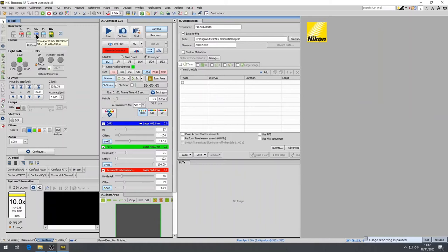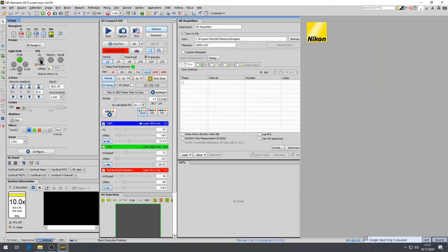Below the objectives you can select the light path where you can choose to either see the samples through the ocular or through the Nikon Elements software and in here you can also set the perfect focus system.